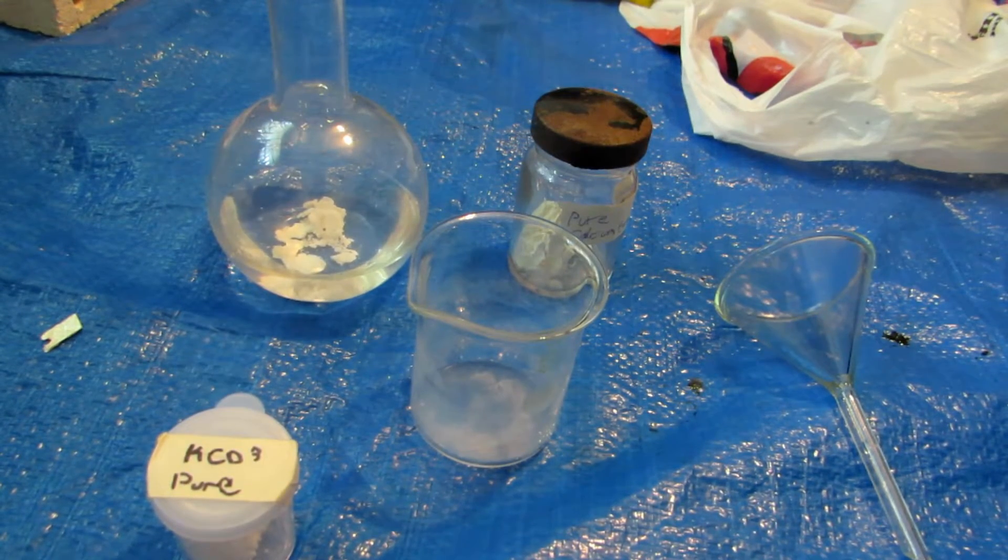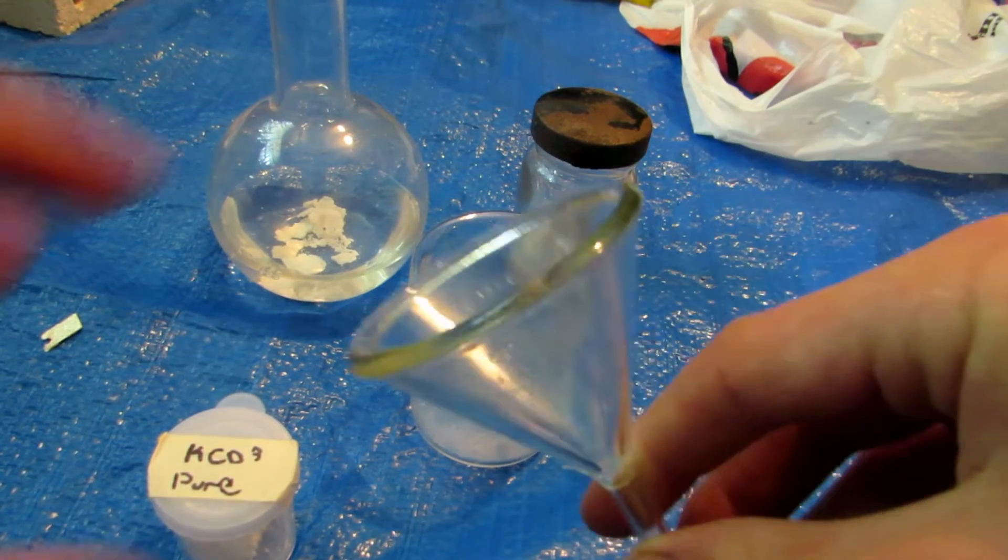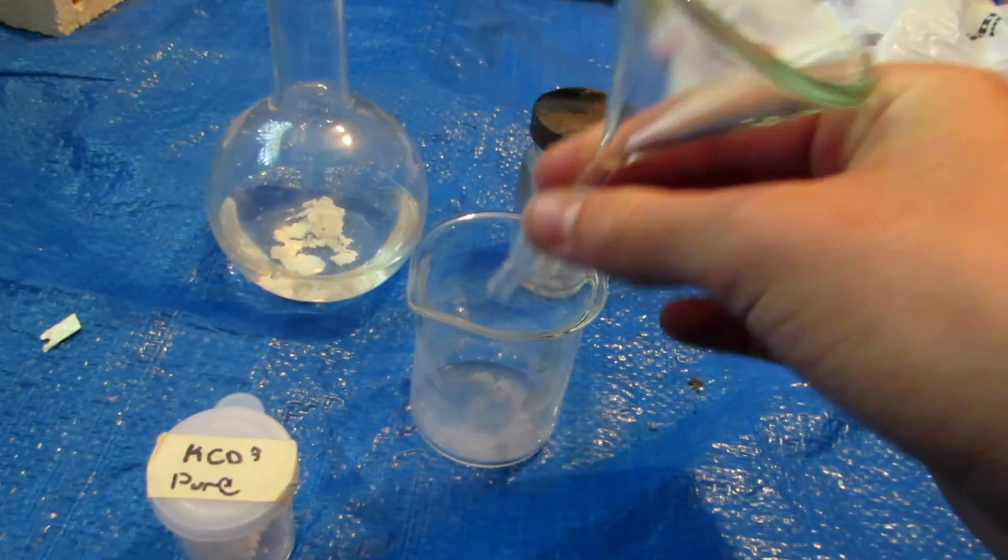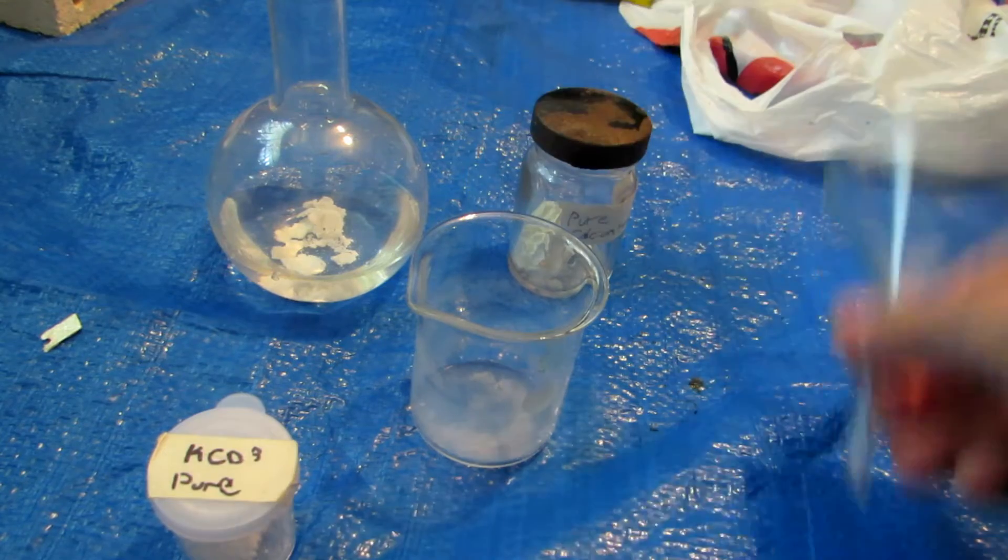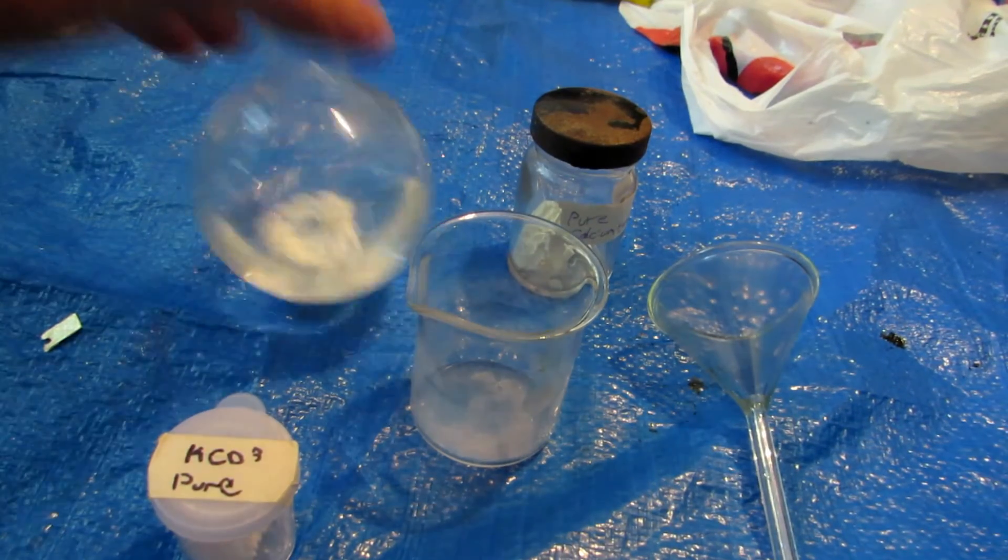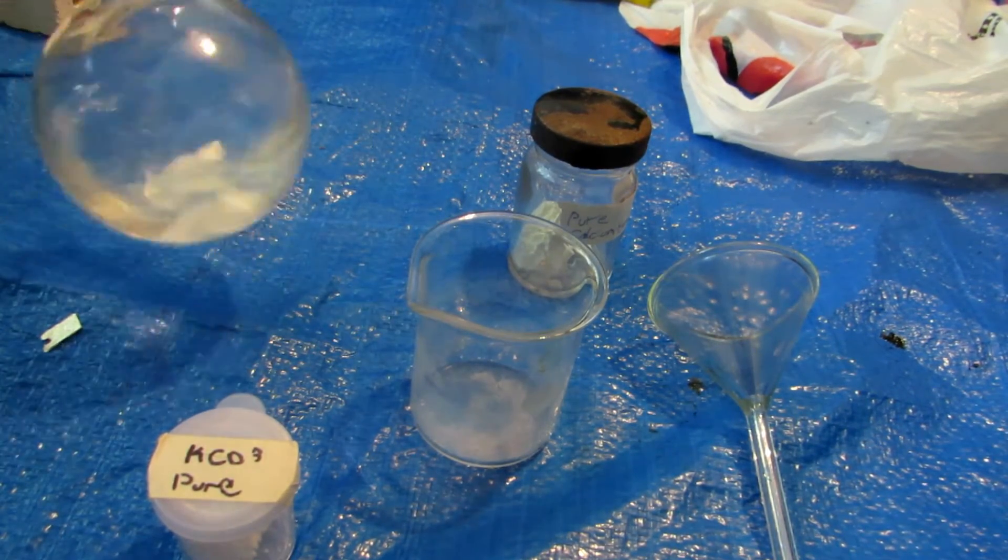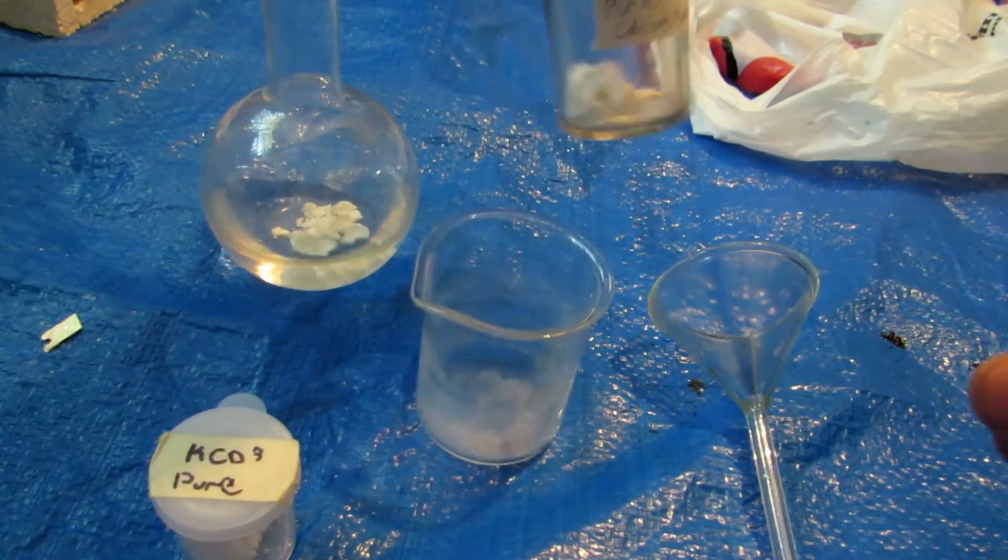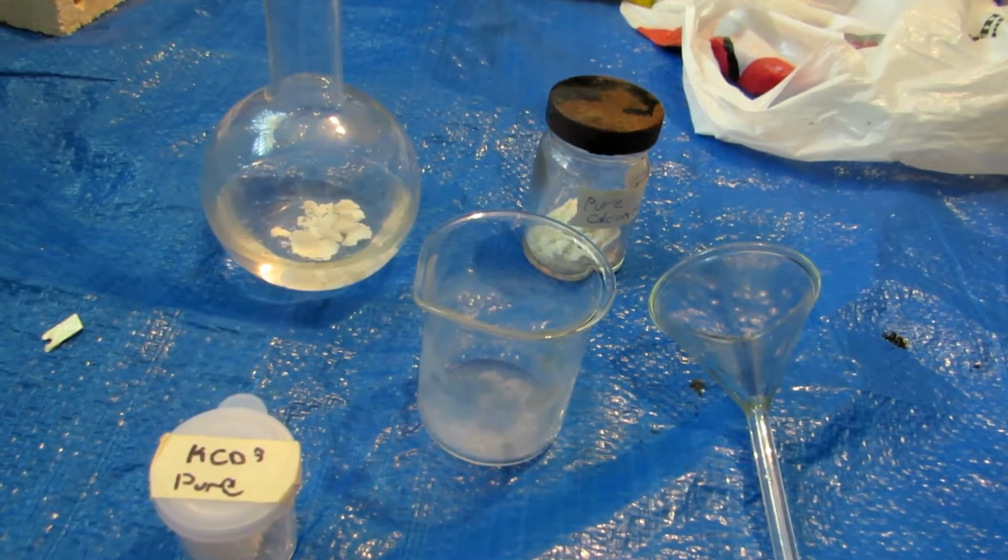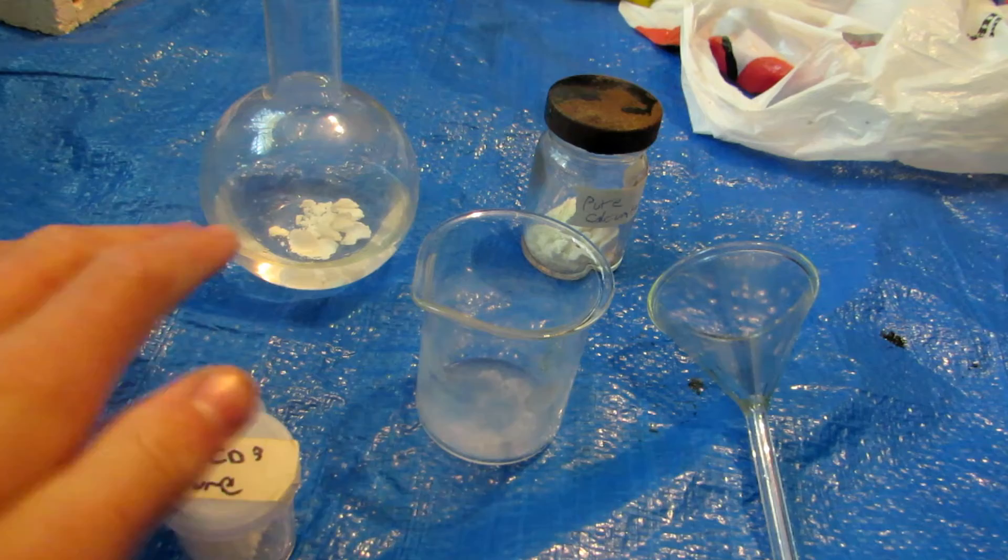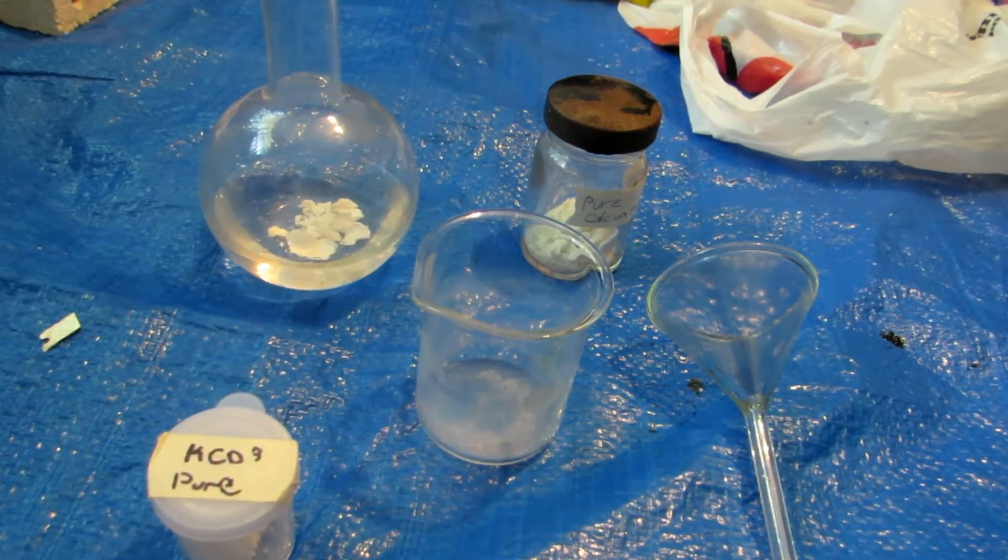Anyhow, so we're just going to swirl this around and make as much dissolve as we possibly can. When as much is dissolved as we possibly can, we'll take a piece of coffee filter, put the coffee filter in here, and filter our solution through the coffee filter into this beaker. The excess calcium hydroxide can then be dried and re-added to our little vial here for future runs. Anyhow, so I'll make sure to swirl this around and create a nice and concentrated solution.